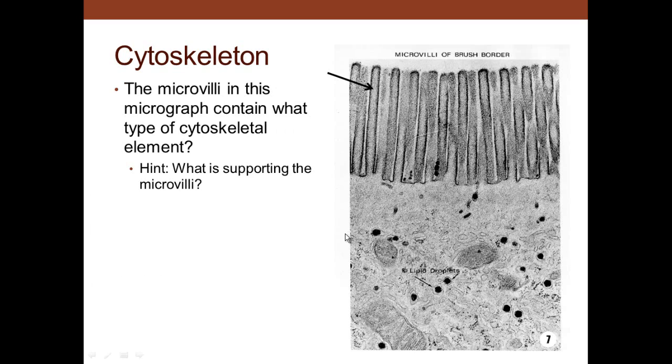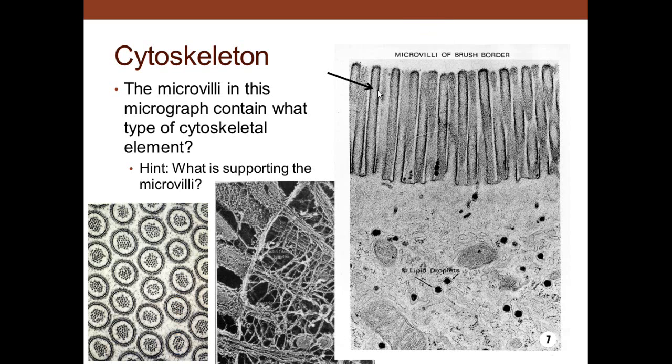Cytoskeletal components: microvilli actually project up and take the plasma membrane with them. So microfilaments projecting up inside, pushing the membrane out, is what makes the microvilli. And if you see a cross section of these, you can see that these are indeed the microfilaments. Down in through there, you've got the terminal web, which is what you see here. This is a plasma membrane, and these are the same as those, and you can see that the microfilaments project up through and push the cytoplasm along and make these.